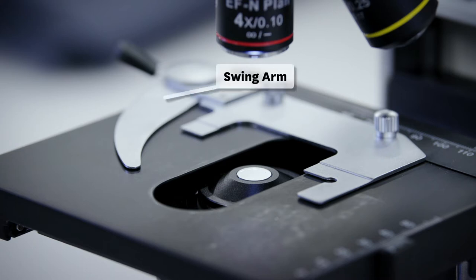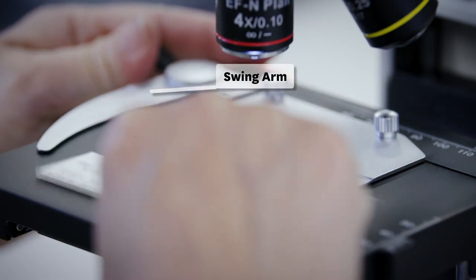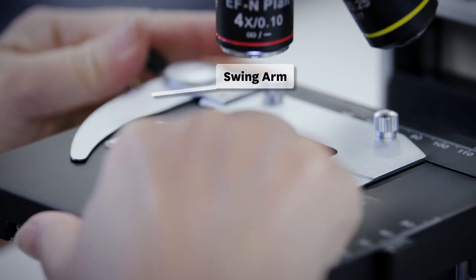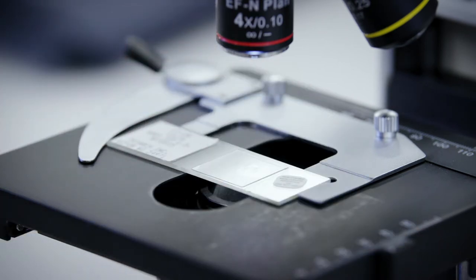Gently open the swing arm and place a prepared slide onto the stage. Make sure the slide is secured with the swing arm holding it in place.